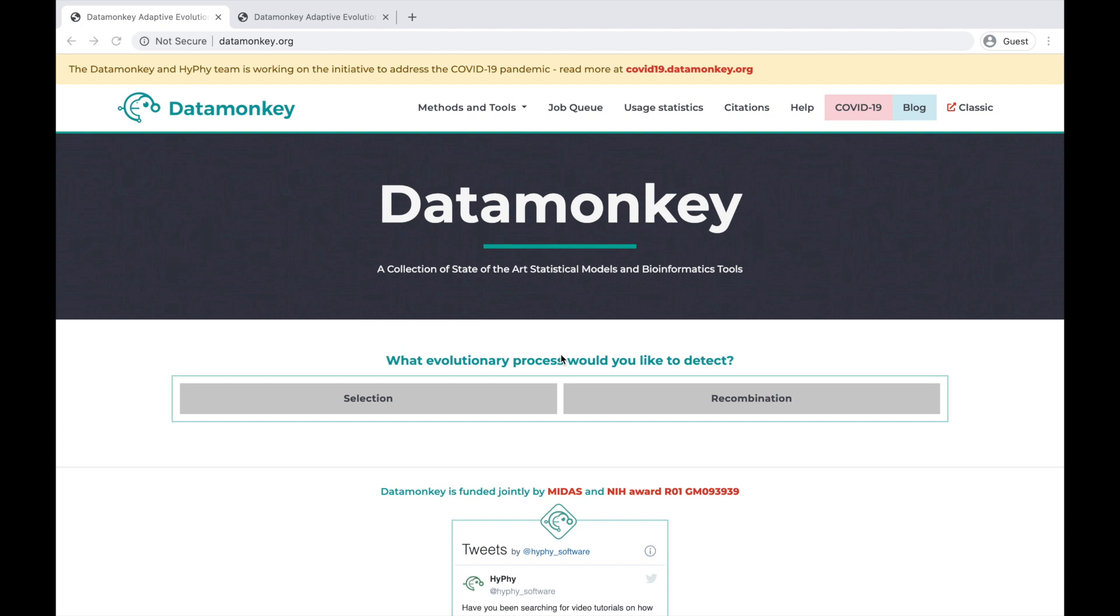Hi folks, I'm Dr. Sadie Wisotsky, and today I'm going to be showing you how to use one of our newest methods, MultiHit, on datamonkey.org.